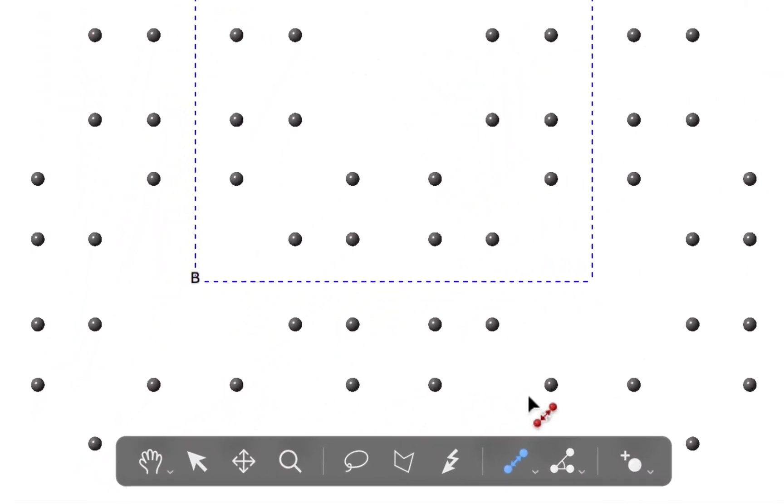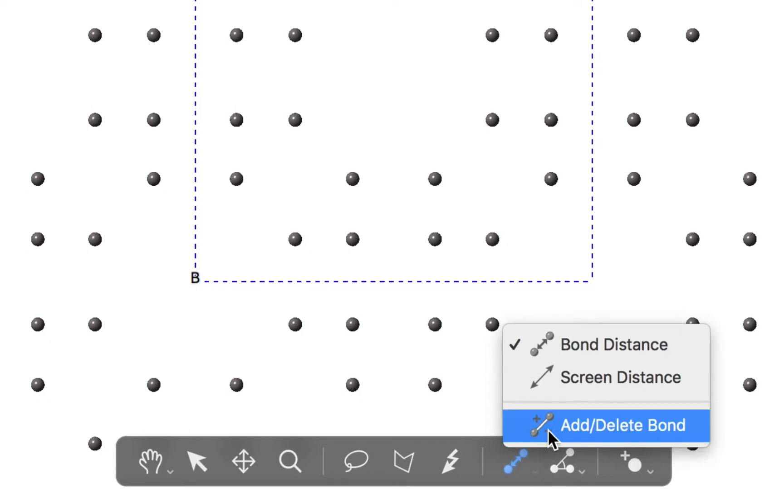I'm going to go down to the tool strip and I'm choosing the add-delete bond tool. That's available on this little popover. You have a choice of bond distance, screen distance, and the add-delete bond tool. They share one position in the tool strip, so you can use the little disclosure triangle down here to display this pop-up menu.